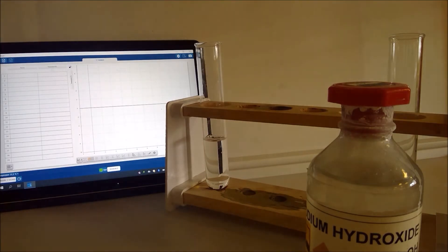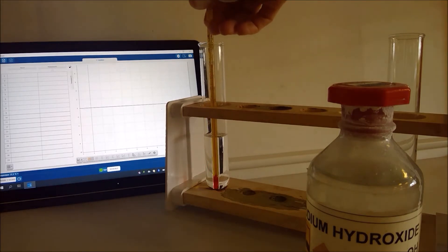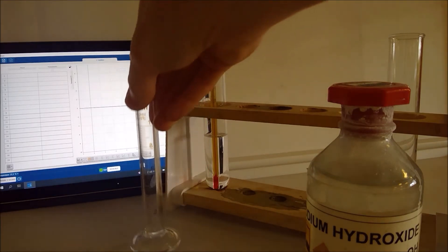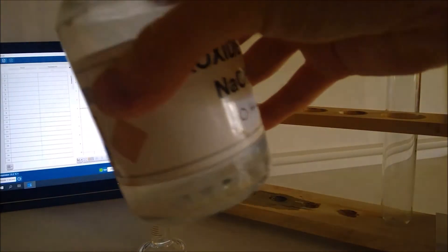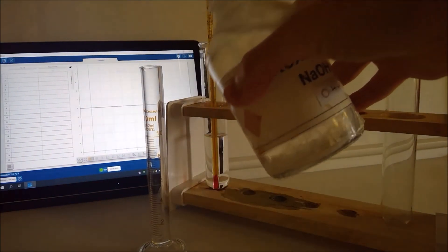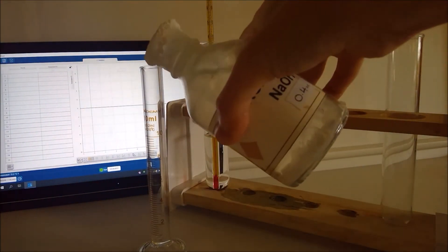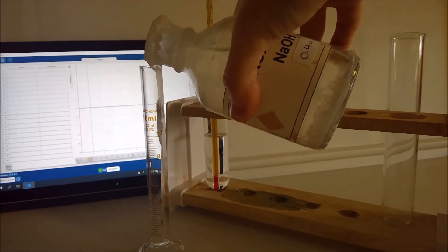And then we need to make sure that we know the temperature at the beginning of the experiment. So I'm going to stand my thermometer in there while I use a second measuring cylinder to measure out 10 centimeters cubed of sodium hydroxide.